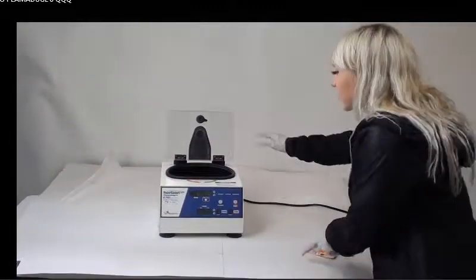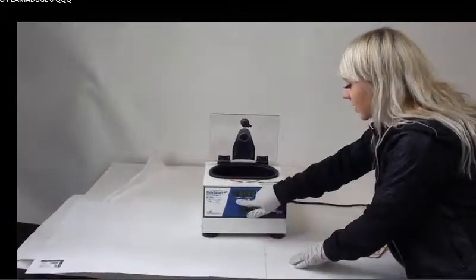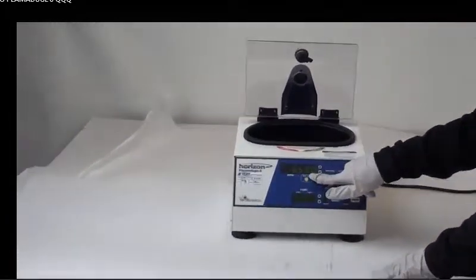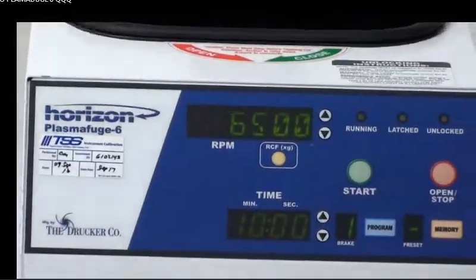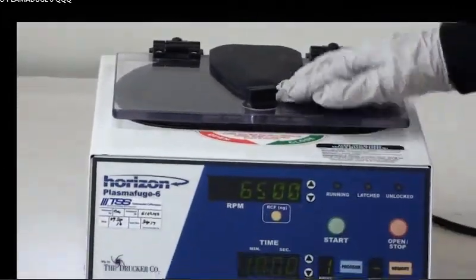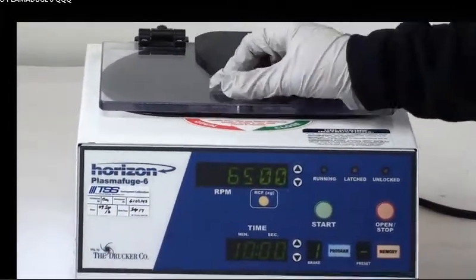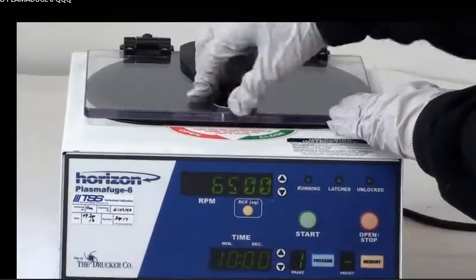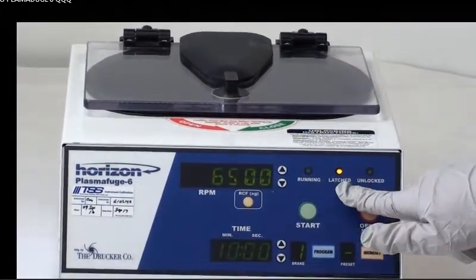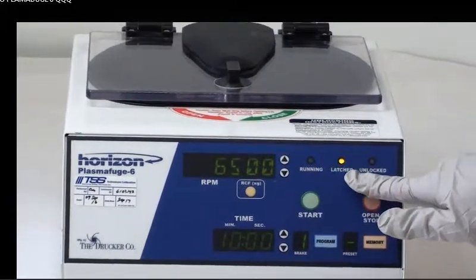I'm going to start off the demonstration by having you see that you can do it at the highest RPM, which is 6500. I'm going to get this ready to show you how it works. I'm going to put down the latch, make sure that it is closed, and you'll see that it is by this light right here under the latch.